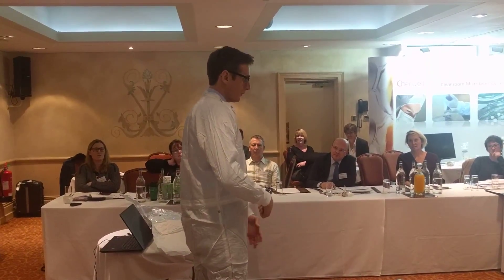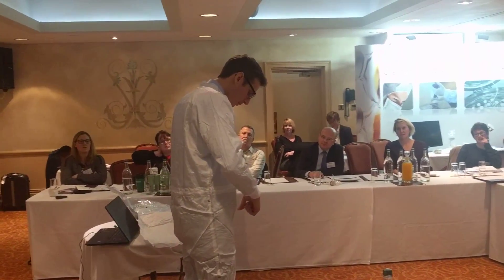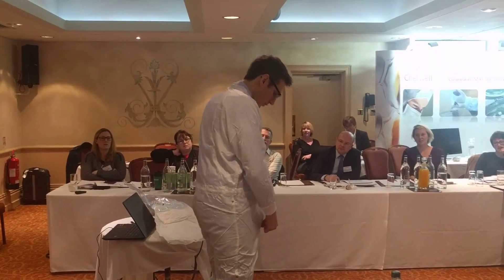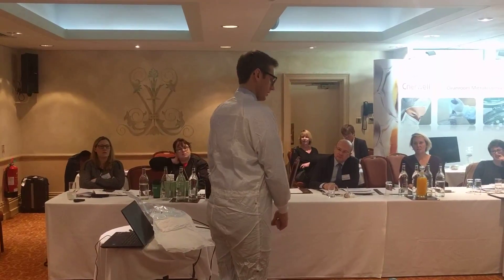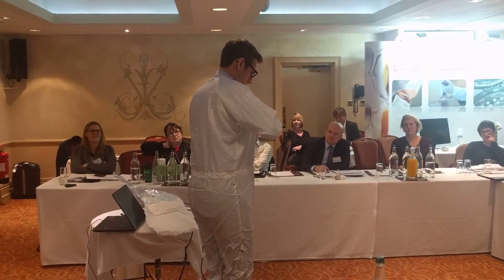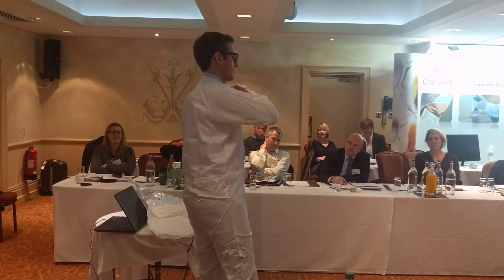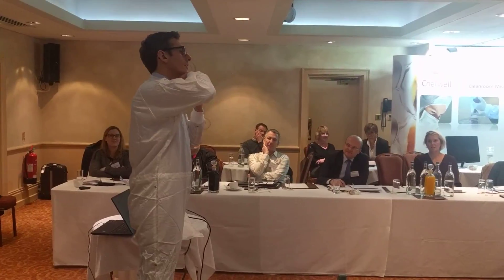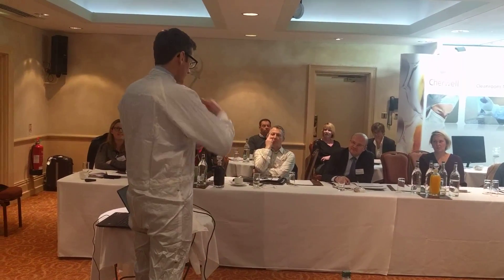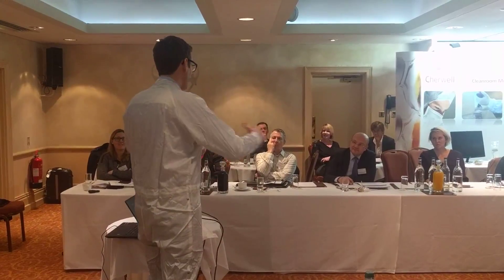To close the zip, we need some tension. There is a simple trick: just cross your legs and stretch, and you have some tension to close it without holding against. Then, with a mirror, you can close the button and check if everything is covered completely. It's not my preferred technique, but I think it's the most confusing technique.